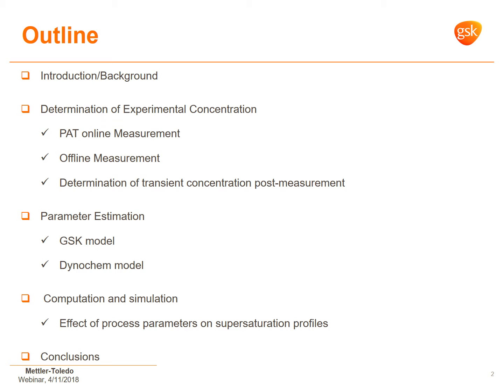So, a quick outline of my talk today. I will start with a background, a problem statement, if you wish. Then I will talk briefly about how we determined the concentration of the salt during the crystallization, which was not a trivial exercise at first.